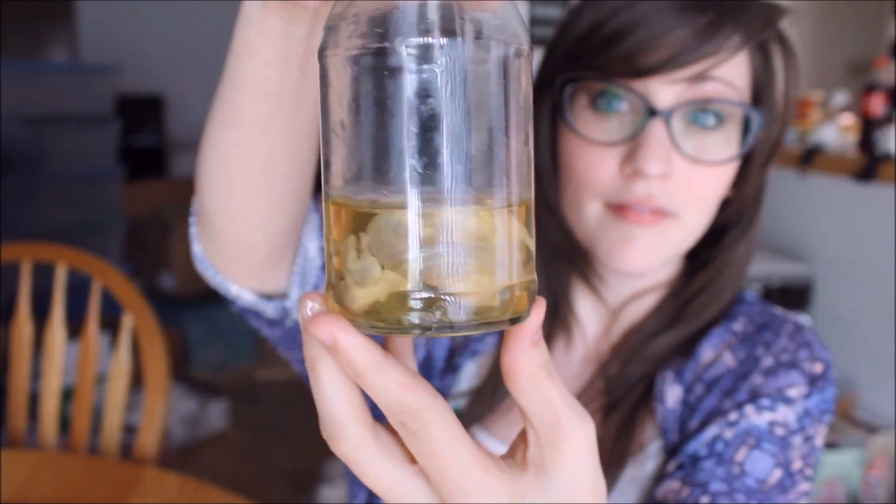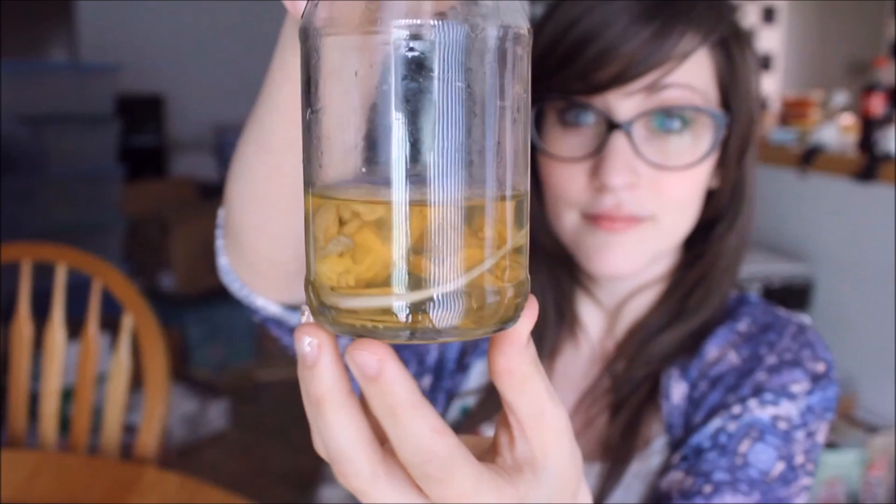It's still formalin — it doesn't change. My mice right now, I preserved them back in November. I've just been busy so I haven't had a lot of time to do anything with them. So the first mouse looks like this — it's in a jar as you can see. My second mouse looks like this.